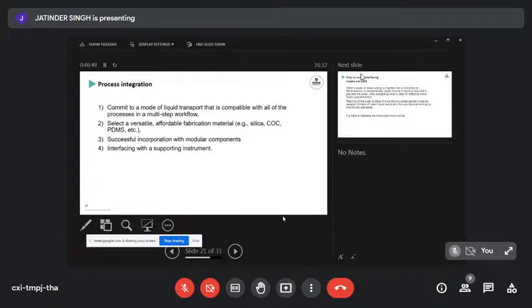So if you're going down the way of getting a whole assay, decide on a way to control your fluid. Pneumatic is not better than centrifugal. Decide on something and make sure that all the different parts of your module are done the same way. You can't have a coherent sample-in, answer-out device when module 1 is using a centrifugal force and needs a spinning disc, part 2 needs a peristaltic pump, and the 4th part uses an electrokinetic system. Stick to a fluid handling platform, and all the modules you develop use that fluid handling platform. Otherwise, you're never going to be able to tie them together.